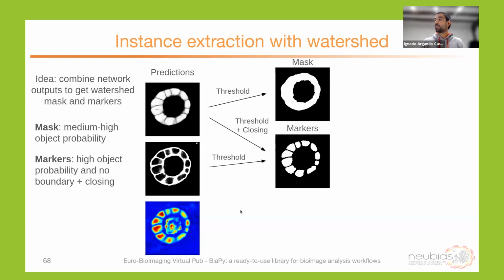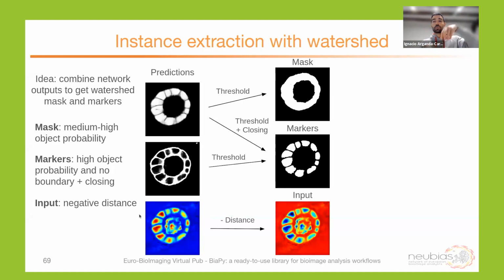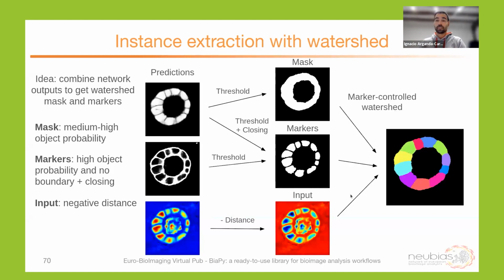And then in the end, we need to run this watershed algorithm in something that looks like a topographical surface. If we use the distance image, we will have the distance to the border. So at the center of the object, we have peaks. And we said that we want to have valleys, so we can take something like the inverse of the distance. So we do this for our 3D confocal cyst images, and we get very nice final segmentations.